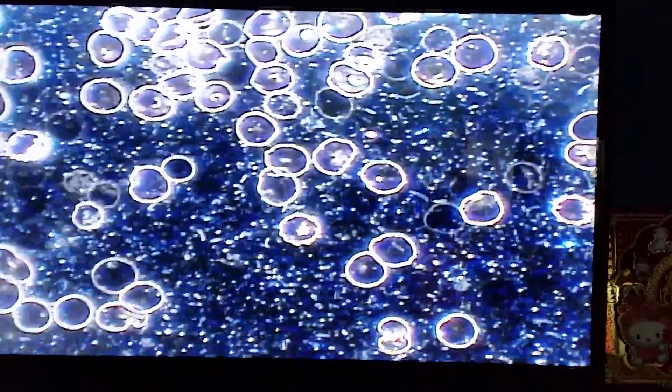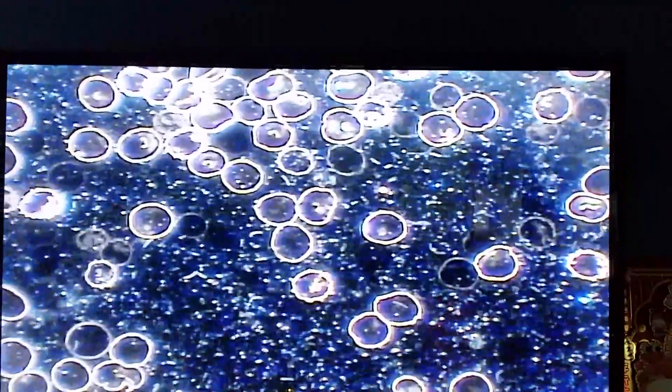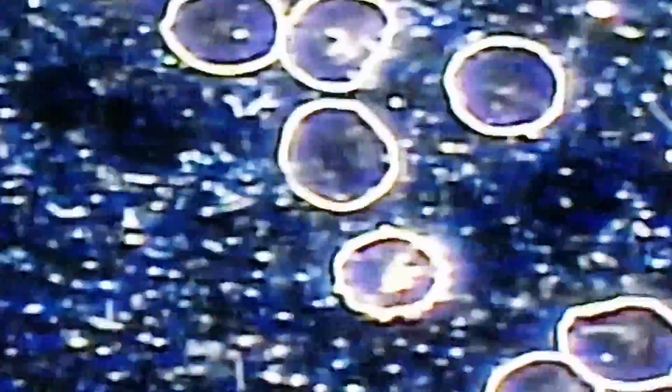Now, if the patient has Lyme, there are spirochete bacteria. Oh, there's a lot in that one. Well, that's the thing. We can tell you it's a spirochete, but we don't know if it is Borrelia that causes Lyme. That's how they look like. So we cannot diagnose using the microscope. However, spirochete is a family of bacteria, and one of the members is Borrelia that causes Lyme disease. But we have a lot in here. Yeah, there's a ton. Tiny little ones. Some are longer, some are shorter. This is only a drop of blood. And we have seven liters. Let me take a picture of this. It looks like worms.